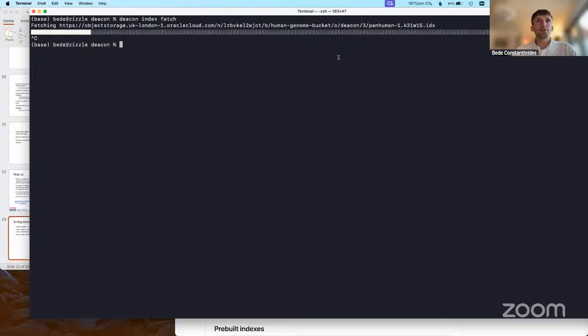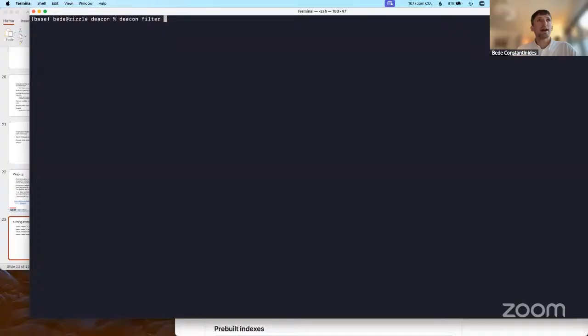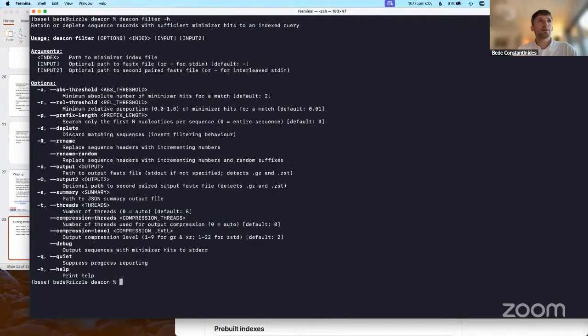To use Deacon, the main command is called deacon filter. I'm going to show the help here with -h to show you all the options. Essentially you write deacon filter, then provide any options, then the path to your index, which is the thing that was just being downloaded.